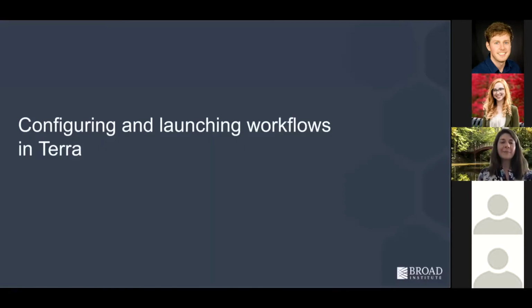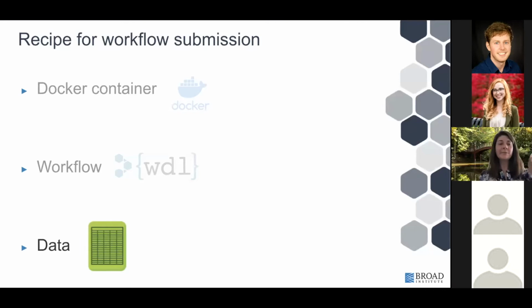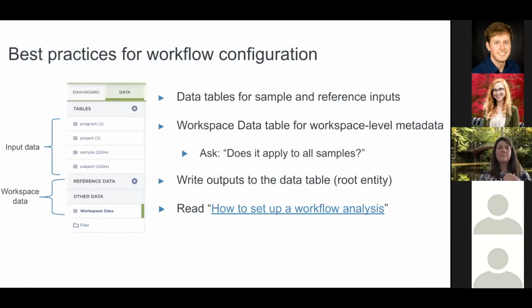Okay, so now that you have imported your workflow to your Terra workspace, we're going to learn how to configure and launch that workflow in Terra. So specifically, we're going to be focusing on the third component that we need for a successful workflow submission, and that's our data. We have several best practices for configuring workflows using data in a Terra data table.